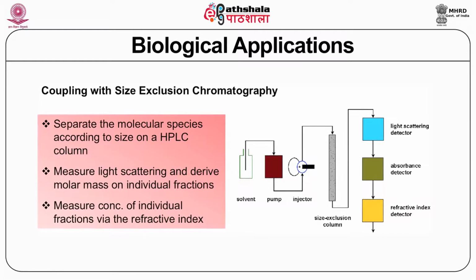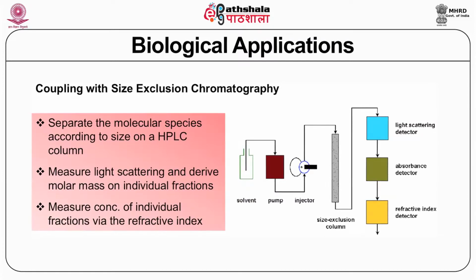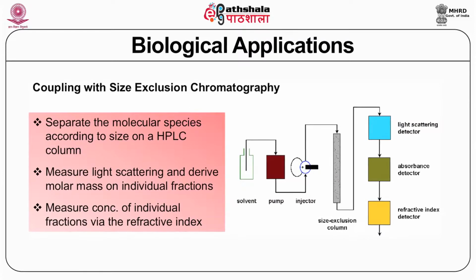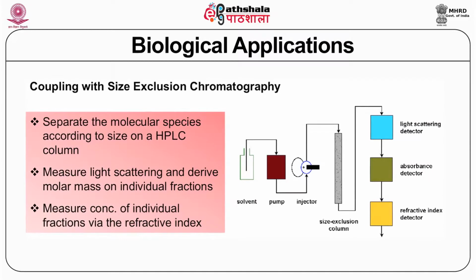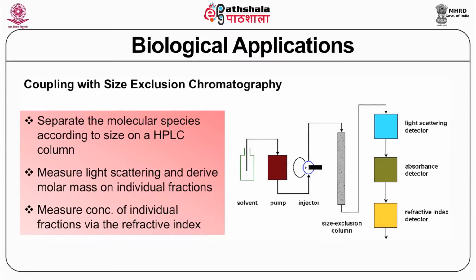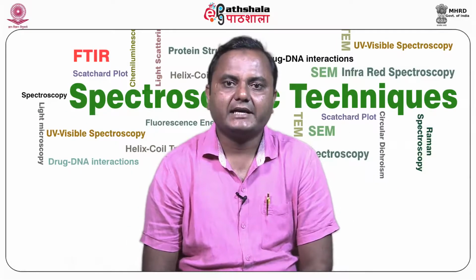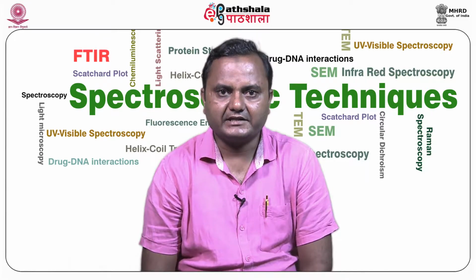You can see here in the figure how the SLS technique is complemented or integrated with gel filtration chromatography, and the concentration of individual fractions is measured via the refractive index. Now, we will discuss the calibration of static light scattering measurements.